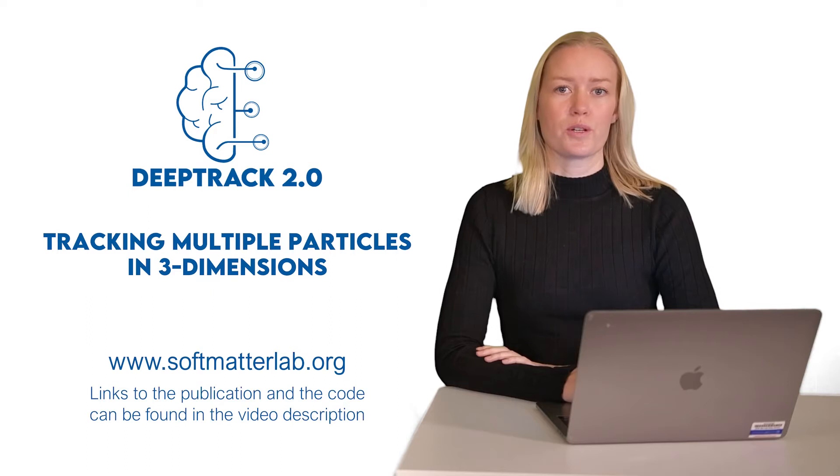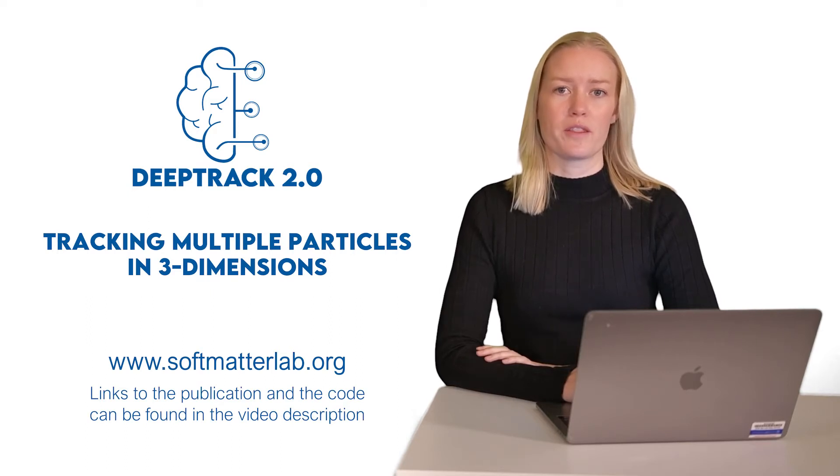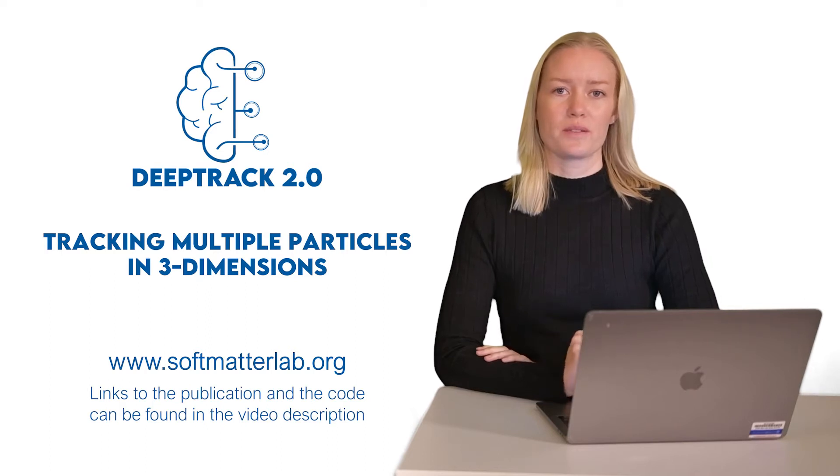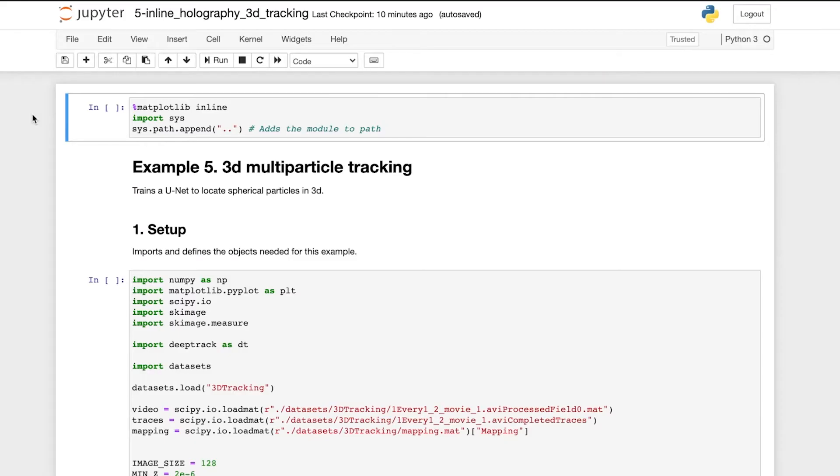In this example, we're going to use DeepTrack 2.0 to track multiple particles in 3D. Hello, I'm Saga and I will be your guide for this tutorial. Let's go through example 5, where we use DeepTrack for multiple particle tracking in 3D.